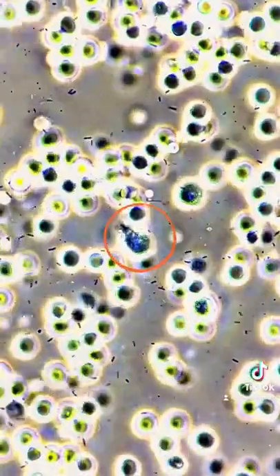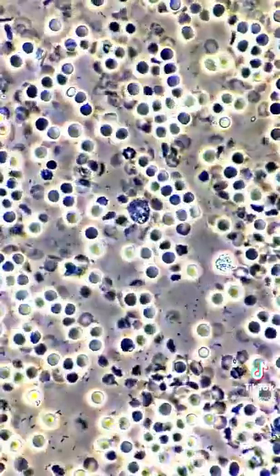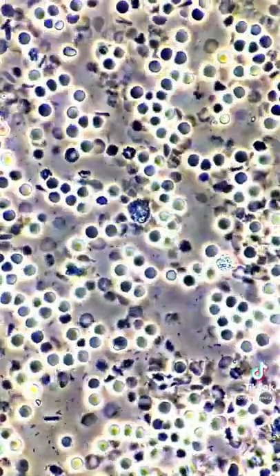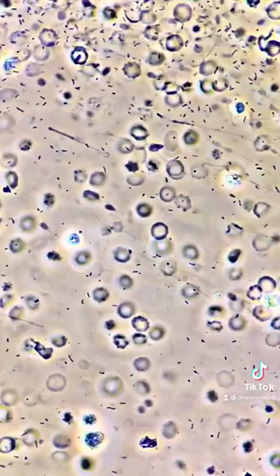I've swapped over to phase contrast just to show you the bacteria swimming around. Although my white blood cells were super active, they were just no match for all the bacteria. Maybe I should add some antibiotics.